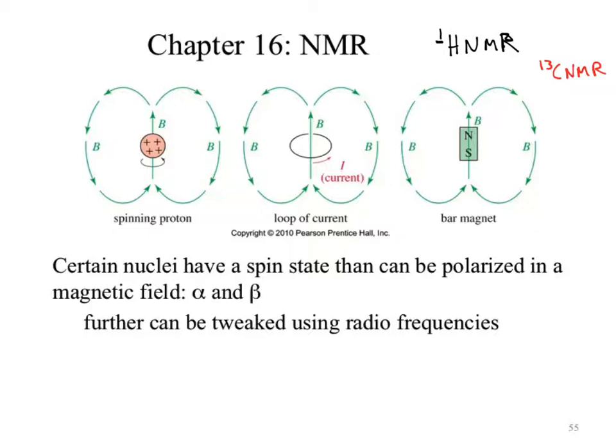So not only do I see a signal due to just electrons being around the magnet, but the magnets being near other magnets will have an effect on what I see. Okay? That is what NMR is looking at, and we correlate the signals that come out of that into massive structural conclusions. Okay? That is why it's awesome.